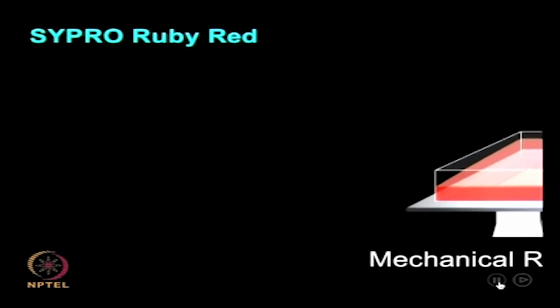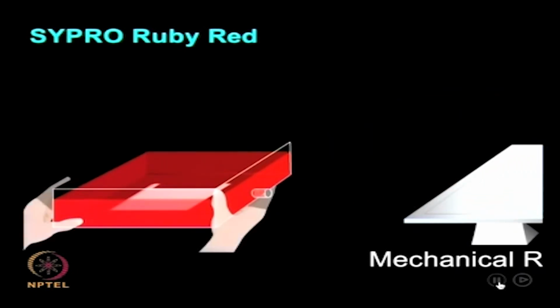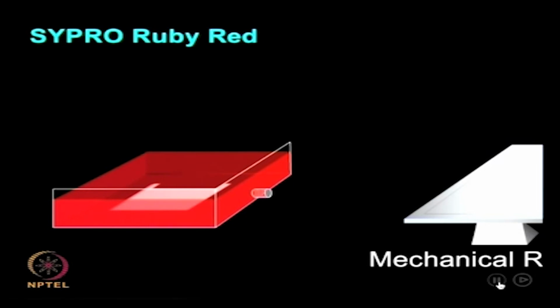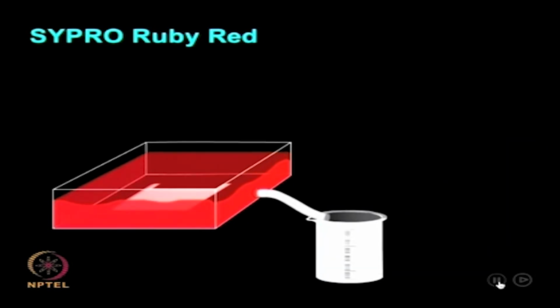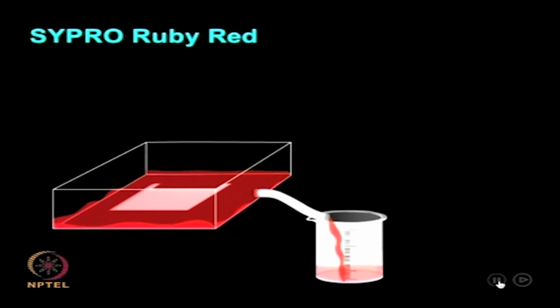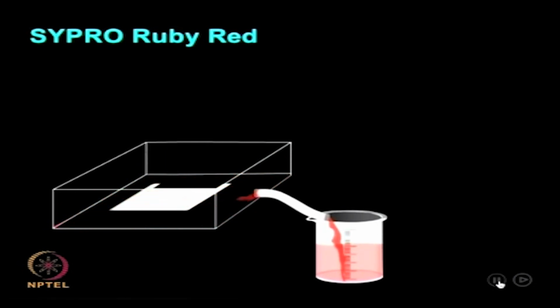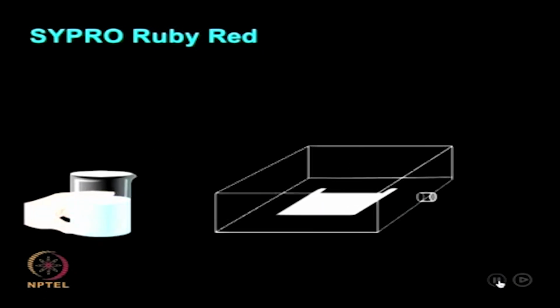During the process, the gel gets uniform staining with the ruthenium based chelate dye. After this overnight step of staining, the gel can be washed with methanol and acetic acid solution.